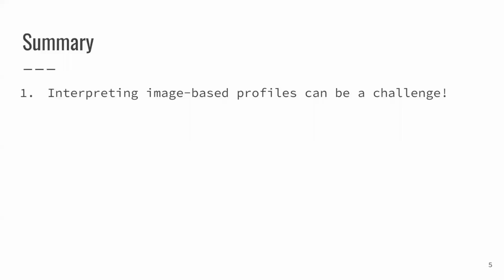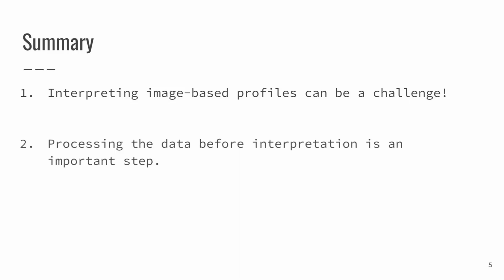Interpreting image-based profiles can be a challenge, and that's why we have tutorials and the publication. Processing the data before the interpretation is an important step: normalizing the data, annotating the data with metadata, as well as doing feature selection. These steps are very important, so we also have those in our notebook.